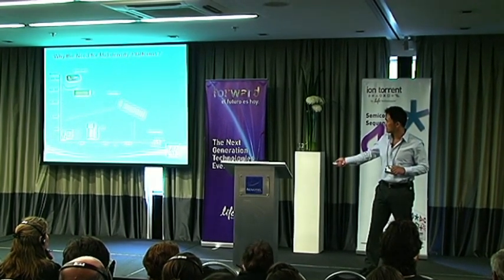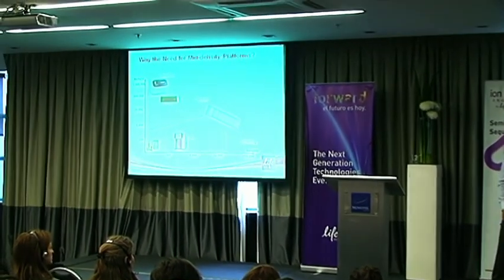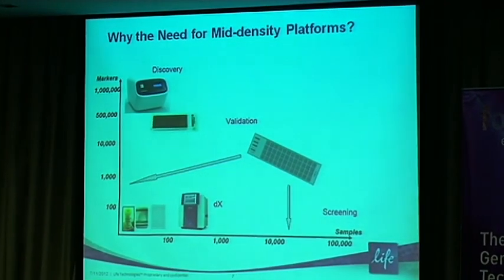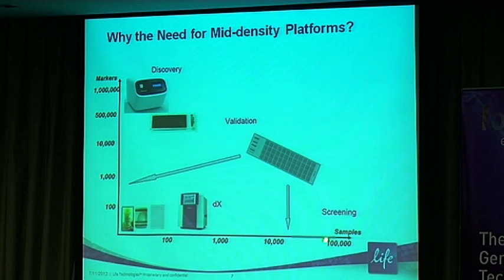And if you get into areas of where you're trying to screen thousands of samples, tens of thousands, maybe potentially even hundreds of thousands of samples, think about, for example, if you're doing a genome-wide association study, right? So you have patient cohorts of 10,000, 100,000 even in these studies. So how can a researcher actually embark in this study by trying to use TaqMan chemistry, but screen that many samples, or screen larger numbers of markers?